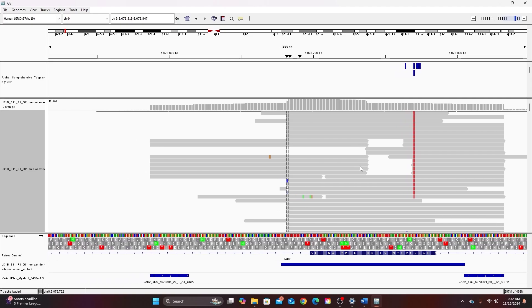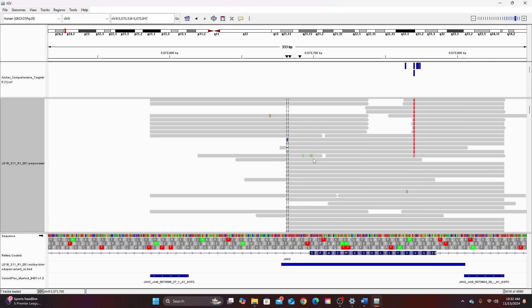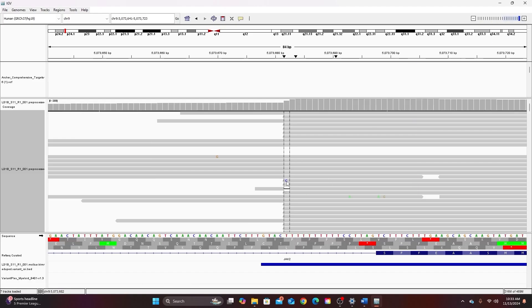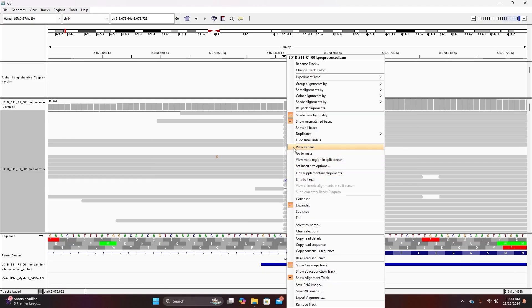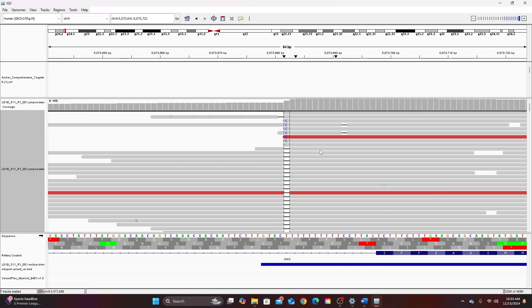You can sort by indels as well. So let's go to a part of the alignment with an indel. There's an insertion and a deletion here. So I'm going to zoom in. So I could sort by base. And by doing this now I have A's at the top here but they're very faint meaning confidence in these calls is very poor. These are followed by C's that were found at this position followed by deletions.